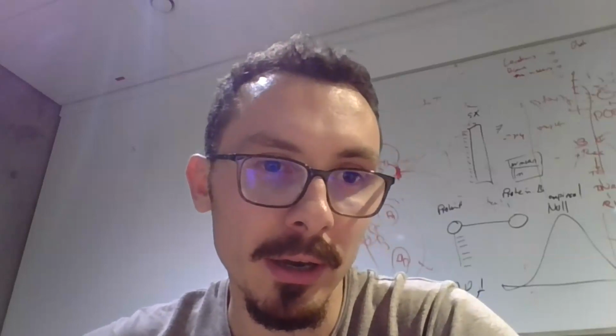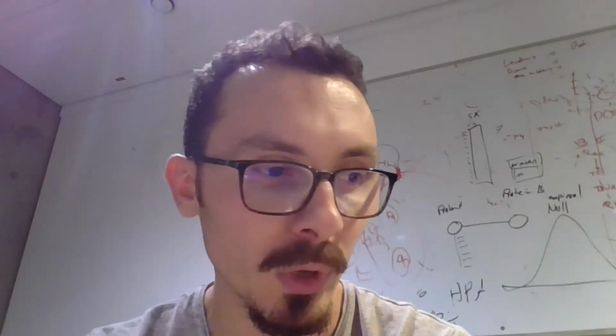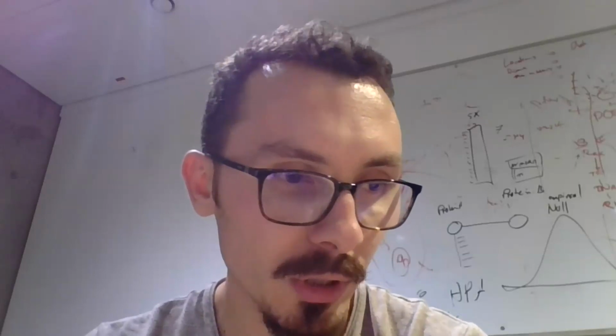Any more questions? Yes, Lina. Thanks for the presentation. I have a question regarding the actual generation of the pseudobulk counts. Sometimes you have a different number of cells between different samples. Do you take the same number of cells from each sample, or do you assume that the DESeq normalization will correct for any sequencing depth or cell number differences? Exactly. When working with differential expression analysis, we assume that DESeq normalization is going to take care of this. But if you want to project your samples into a PCA or a UMAP or whatever, then we run standard normalization and log, and we work on that.